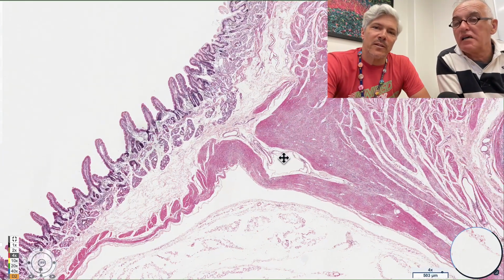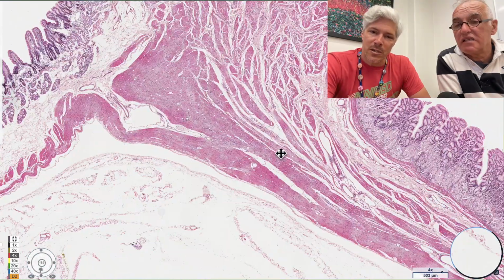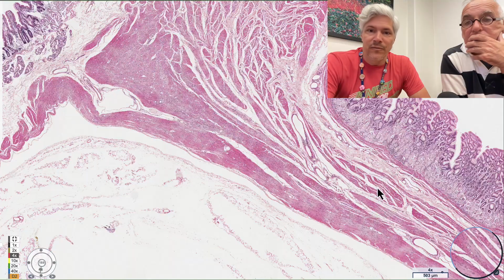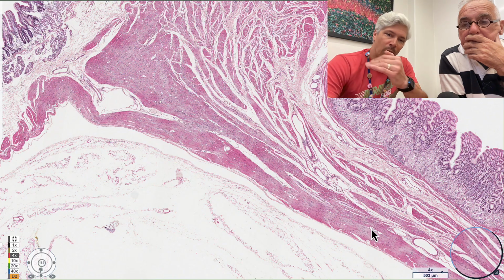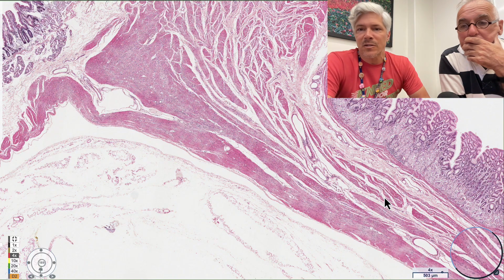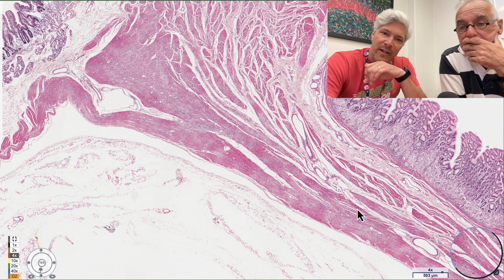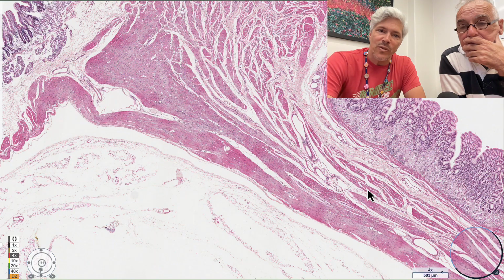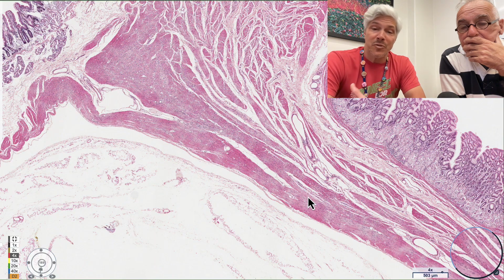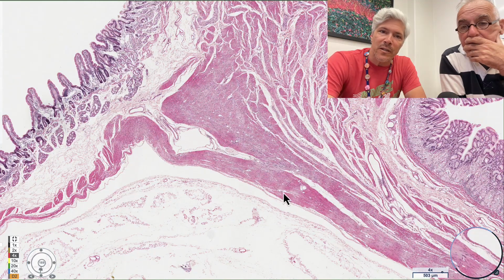I am going to come back to this and just point out that if we look at the muscularis externa of the stomach, I'm going to go ahead and suggest that there's certainly a discrete sublayer here, all the way out away from the lumen, and then there's some fascicles of muscle that look organizationally a little different. I think we might look for our myenteric plexus in that region there. I think that's sort of a division between two sublayers. And then watch what happens. This presumably outer longitudinal muscle extends like this, and maybe it thickens a little bit here.